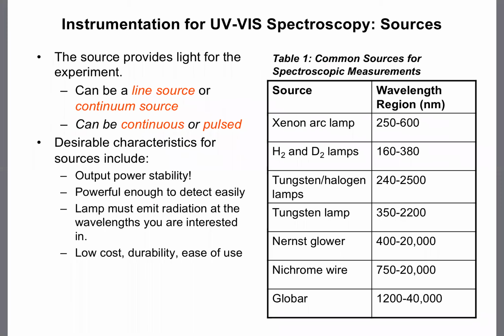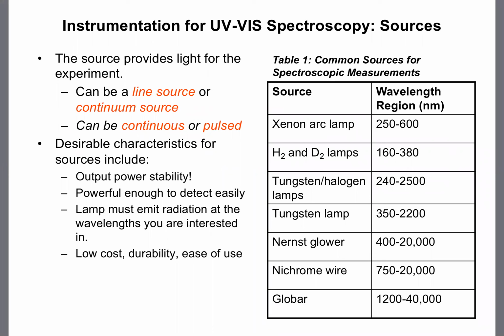Let's break them down in a little bit more detail. Okay, now I'm not going to have time to go into extreme detail on every single part. Again, if you really like this topic, you might want to take instrumental analysis with Dr. Pappas, and he'll be able to tell you a lot more because that class doesn't cover the whole first half of this one, okay? But spectroscopic sources provide light for our experiment.